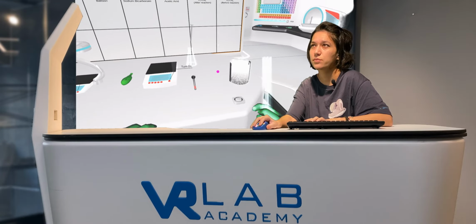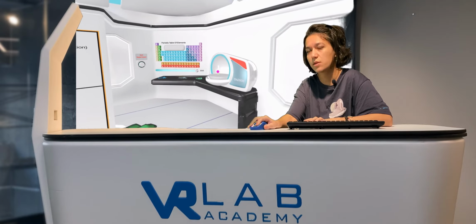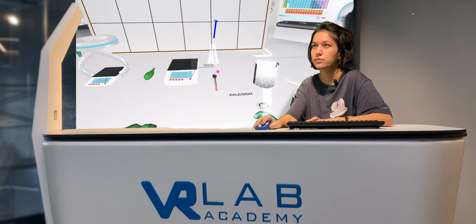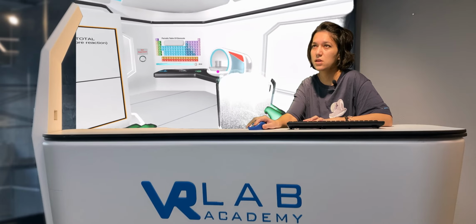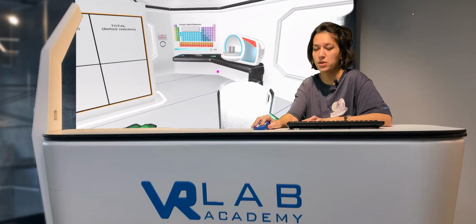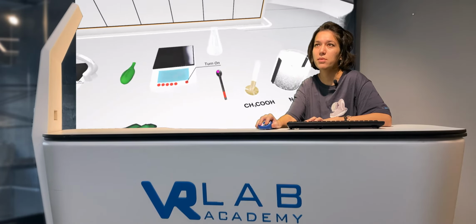I put my cylinder in the analyzer. This is the analyzer, and it gives me the content of the cylinder. It was acetic acid. And this is sodium bicarbonate, my raw materials to use during my reaction.